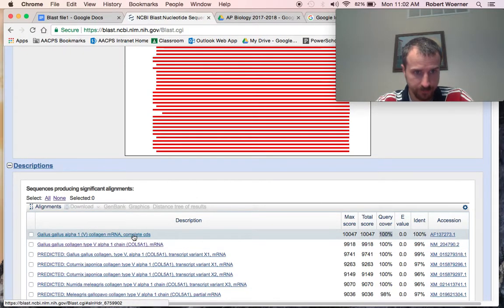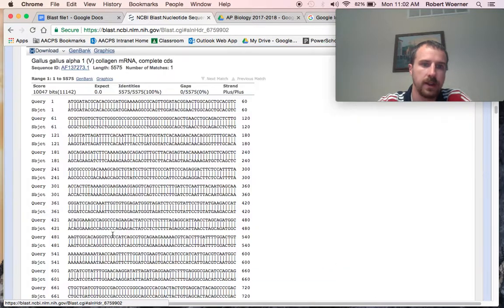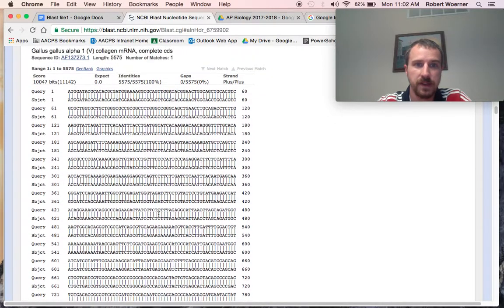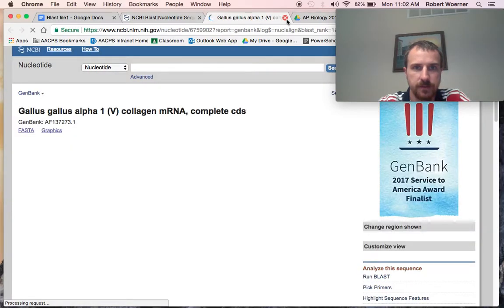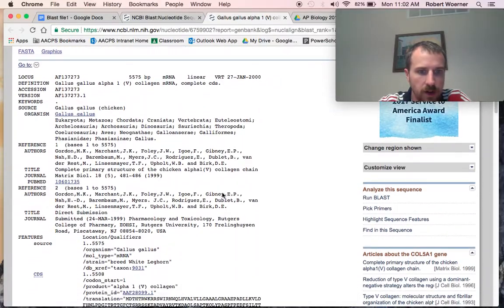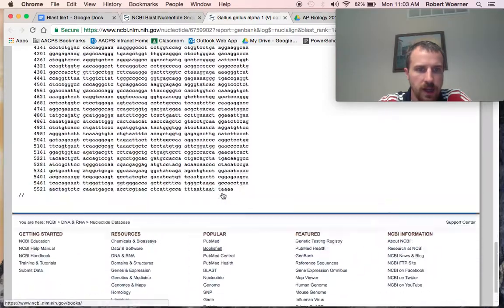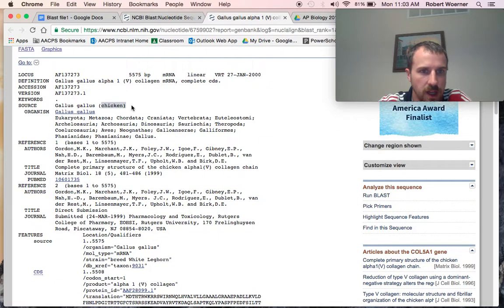Now, we can look at what it's coding for and its collagen. If I click on this, it's going to give me how everything lines up. Now, you could go through here and find any differences, but you're not going to find any because they're all the same. There's no gaps. There's 100% commonality. Any time that we do this, we can also look at sequence. These are the people that found it first, and they give all the data. They tell that it's the chicken. They give you the organism's taxonomy, and that's about all you can determine from this page. It's collagen, the mRNA.